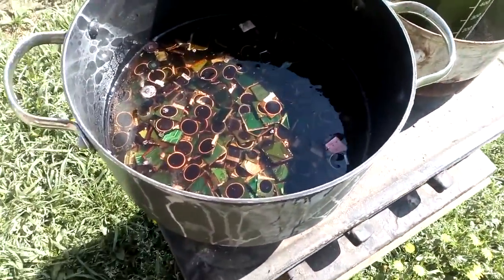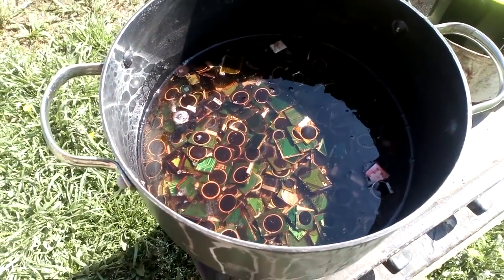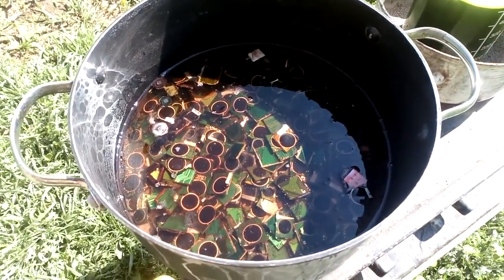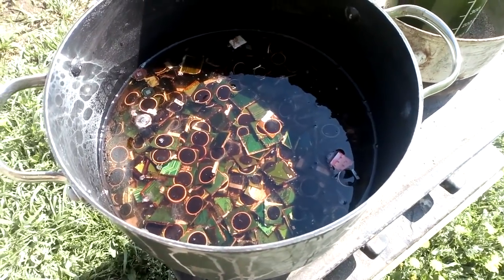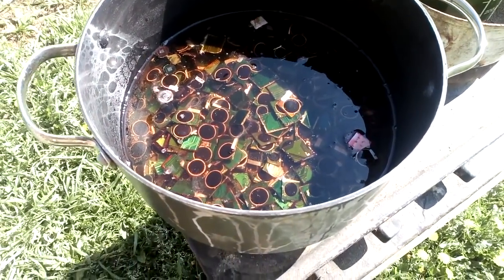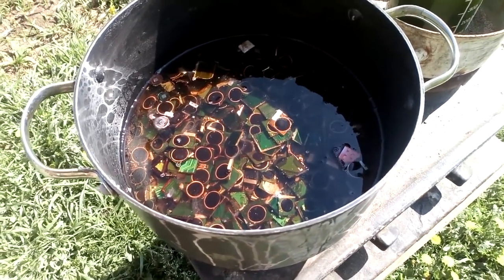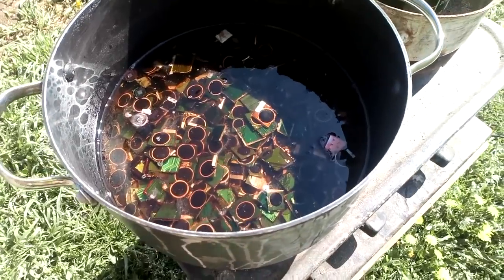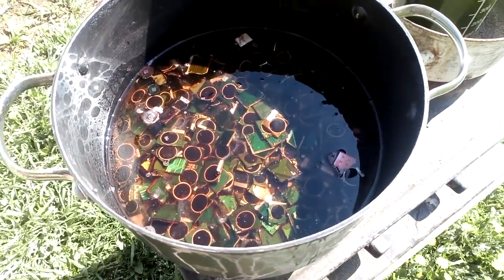Okay, we start. We add some sulfuric acid to this chip. I split that into two different batches because of the amount. You've already seen a couple of times how wet ashing actually works, so I will not show this whole process.